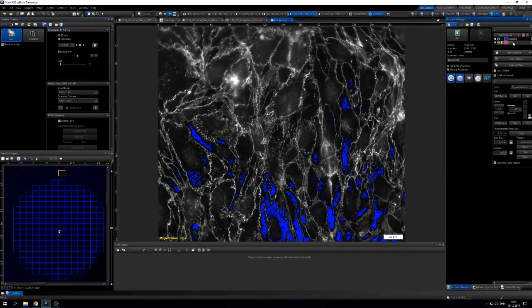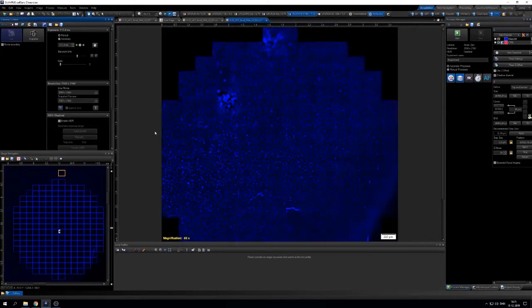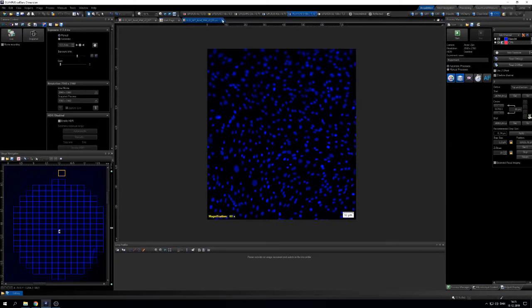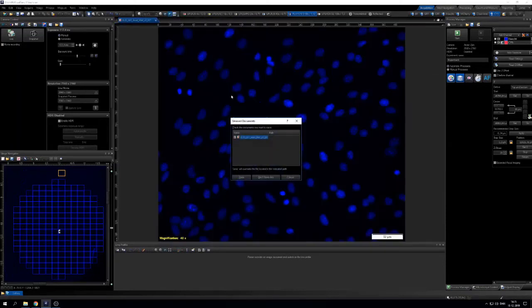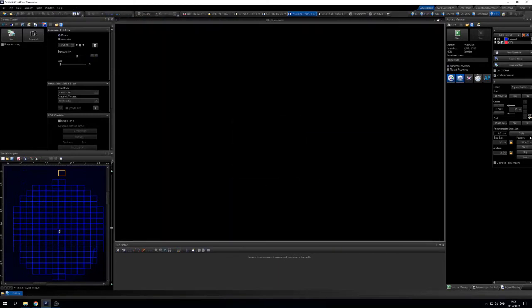So back to Process Manager. Once you have found your exposure time and your settings, you go to Read Settings, so the Process Manager knows the exposure times, etc. I just make a clean appearance here, so closing all the files.